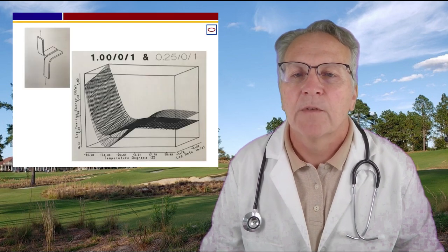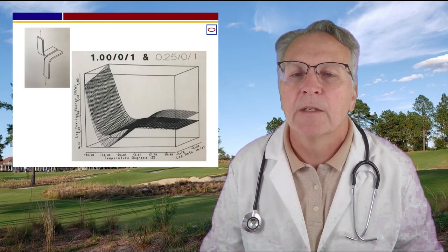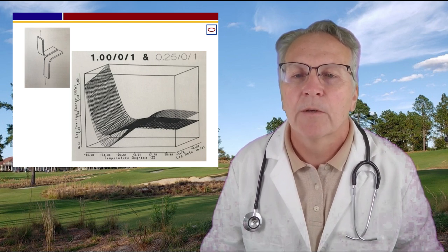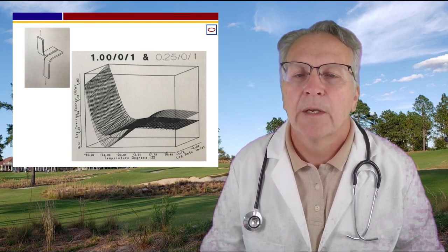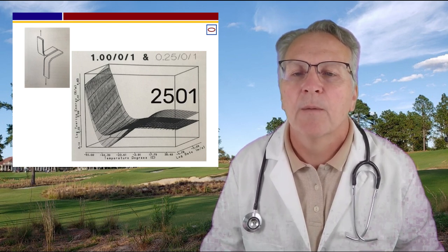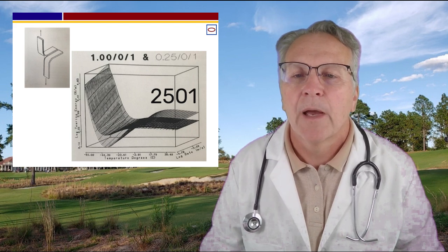Tear strength is often important with flexible polymer products like tires, rubber balls, and hockey pucks. Higher tearing comes from an ability to dissipate energy, which increases as you decrease crosslink density. A plot of tearing versus test temperature and test rate for polyisoprene at 2 crosslink levels is shown on your screen, and the lower crosslink 2501 has higher tearing values at normal use temperature, since a looser network has an improved ability to dissipate energy.